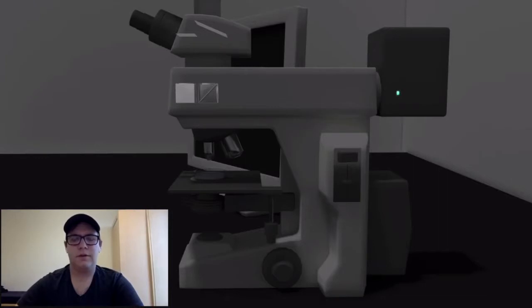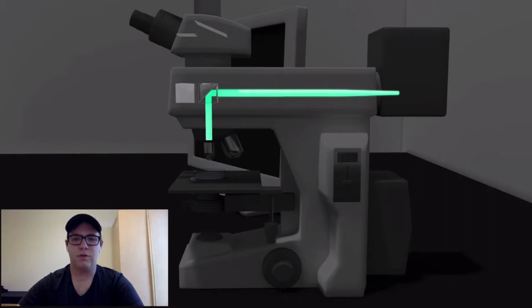In fluorescence microscopy, the indicator dye in a sample excites at a specific wavelength and emits fluorescence at a slightly longer wavelength. Our design imparts fluorescence using an LED and captures it with an emission filter and a camera. Here's an animation of the path the light follows in a standard fluorescence microscope. Our design differs slightly as the sample is located above the objective instead of below, and utilizes a single wavelength LED instead of a filter to select excitation wavelength.